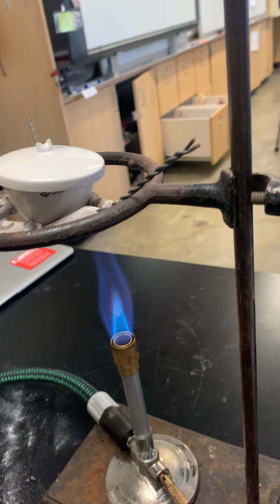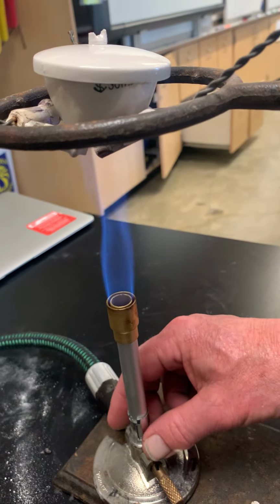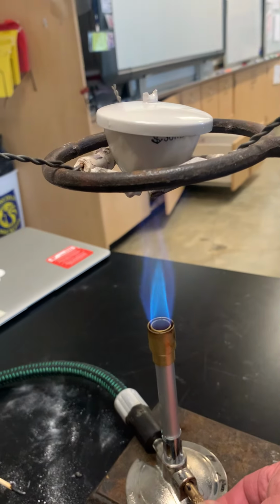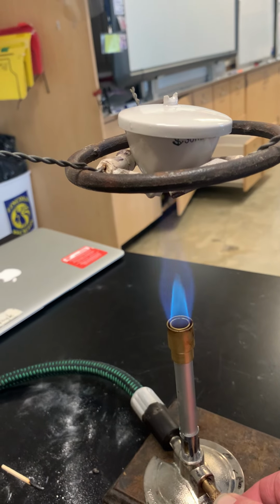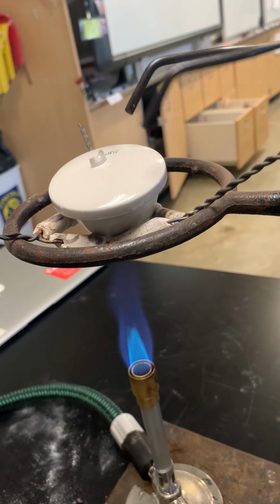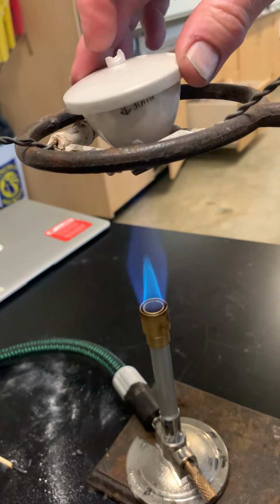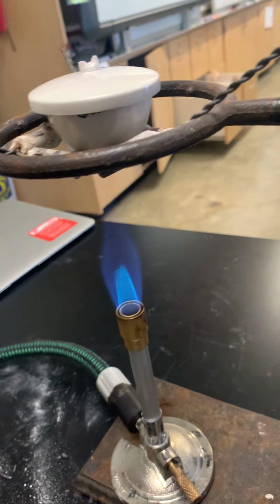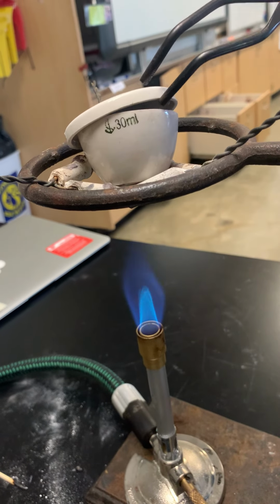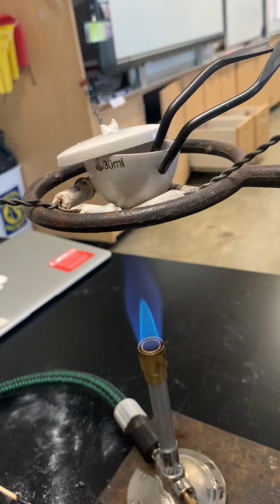Now, it's supposed to be a low flame. There we go. And we're gently heating this, and we need to see inside. So we're gonna move this. This hasn't heated up yet. Yes, it has. There we go. We gotta see inside so we can see the reaction.